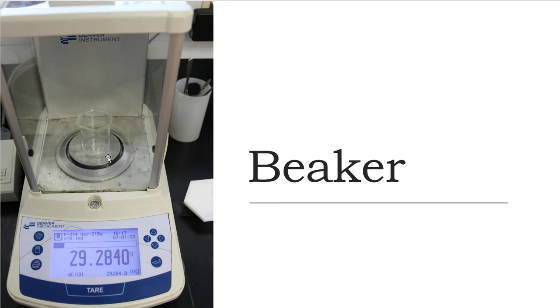The reason that I weighed this beaker is because as I'm distilling my product, I'm probably going to get some stuff in the beginning, and I'm going to get rid of that stuff in the beginning in another trashy, nasty beaker that I don't need to weigh, and then when all of those impurities come off, well, I want this beaker to be there just so I can catch that pure organic product that I'm after.